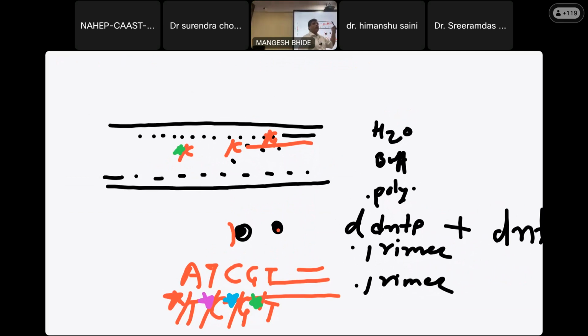So you have a PCR product, you have to purify this PCR product, and you have to send this to the company. What the company does is this reaction. This reaction is also a PCR reaction. The main difference is there is only single stranded PCR; you don't have the other strand.